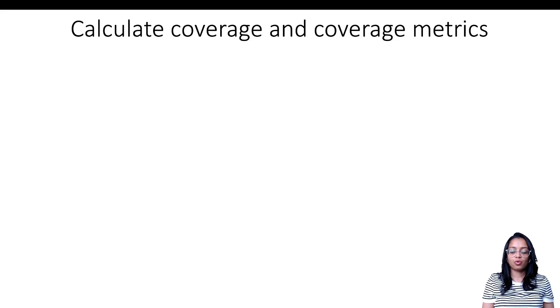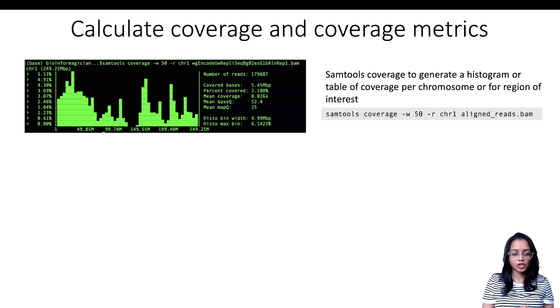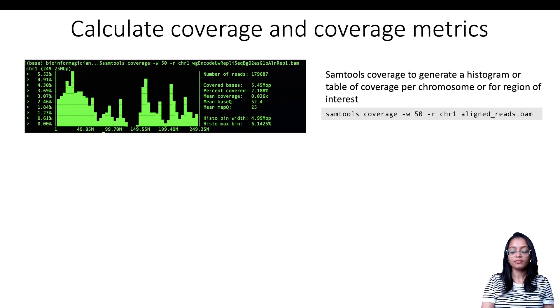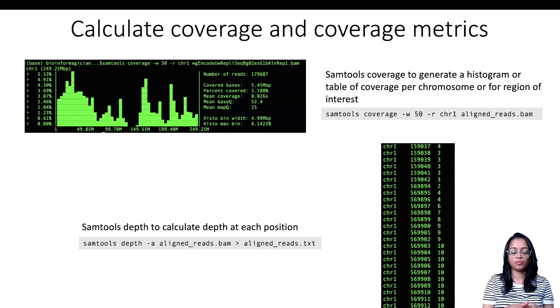Besides visualizing reads and coverage in IGV, you can also calculate coverage and generate coverage metrics from your BAM files using various tools. One example is SAMtools, which has two relevant functions. The first, 'samtools coverage,' generates a histogram or table of coverage for each chromosome or region of interest, and also reports the percentage of bases covered, mean base quality, and mapping quality — it takes a BAM file as input. The second, 'samtools depth,' calculates depth at each position, outputting the number of reads aligned at each position in the BAM file.